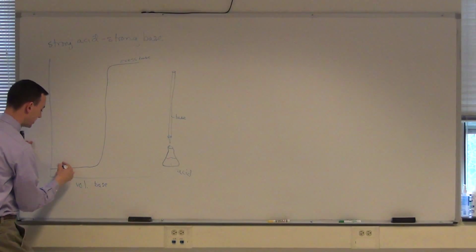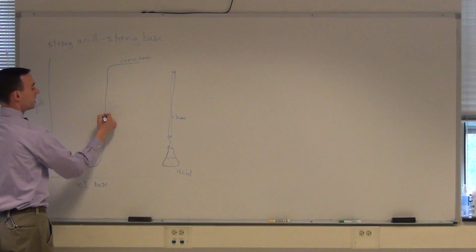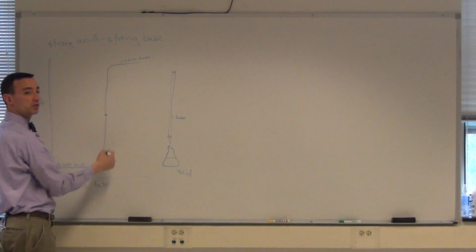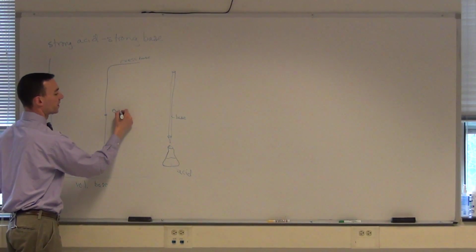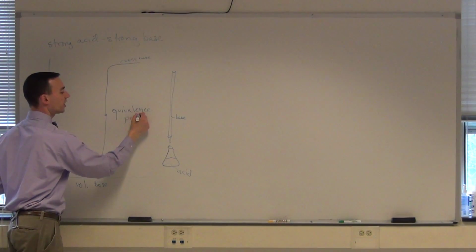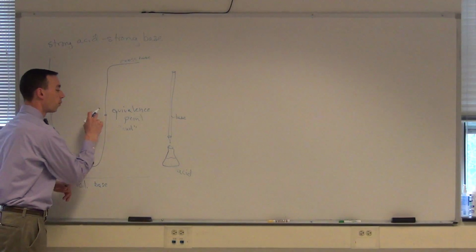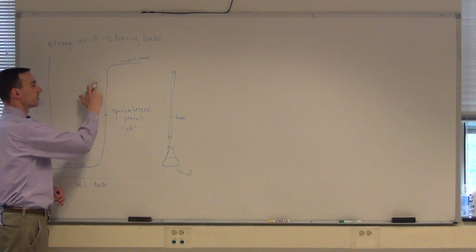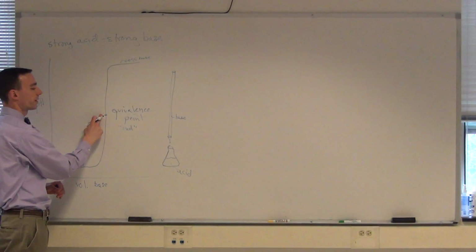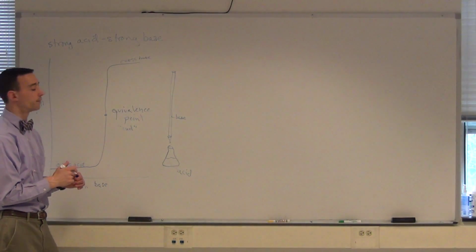Excess acid at the start, excess base at the end, and right in between them, at the point of inflection, where the pH is rising most rapidly, is what we call the equivalence point. It's often also referred to as the end point of your reaction. In Chem 1, that is where you stopped. You never saw this second portion of the reaction, because this is where your color change would have occurred for the acid-base titrations that you did in Chem 1.